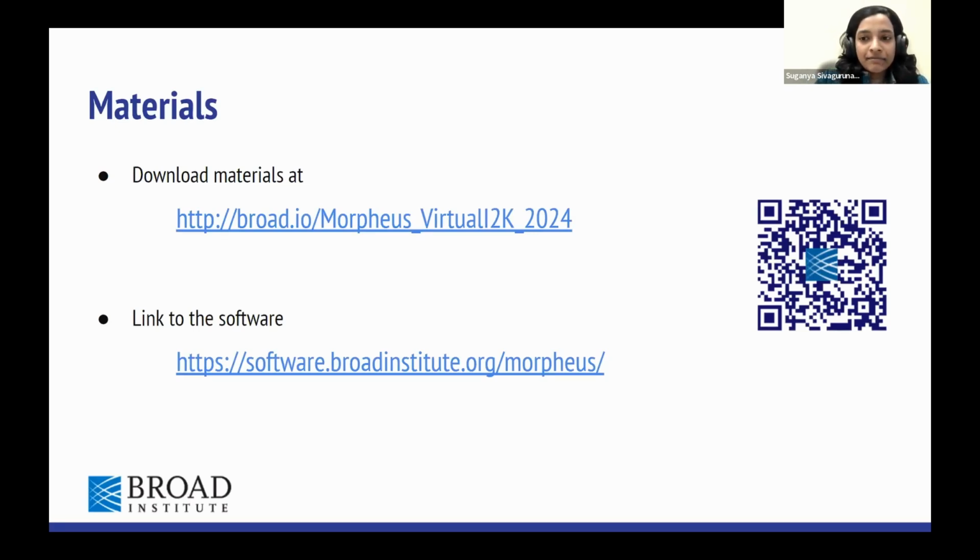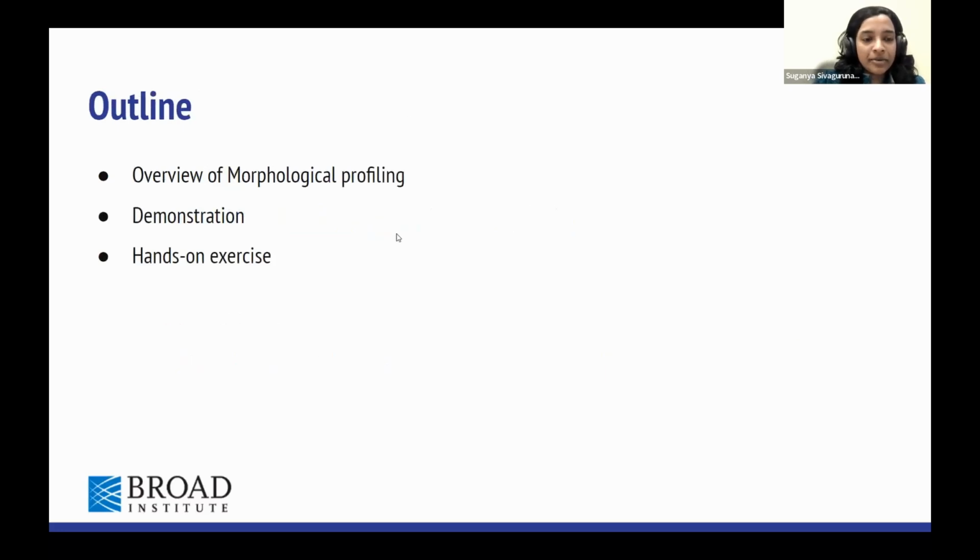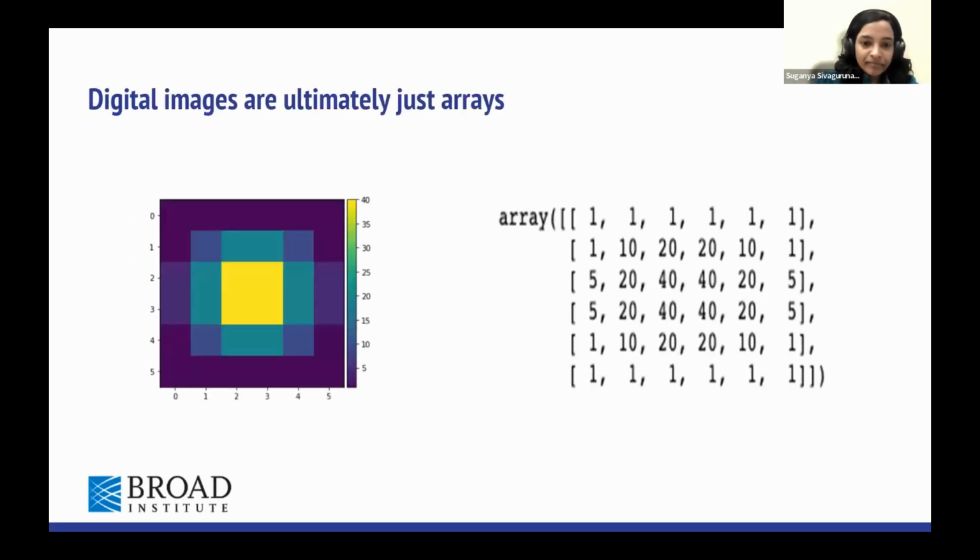Yeah, so I have structured the workshop in such a way where I'll be giving you an overview of morphological profiling. Why I'll be talking about morphological profiling is I'll be showing the use of the Morpheus tool, explaining morphological profiling. And then I'll give a demonstration of Morpheus using the various features, how you can explore your microscope information that you obtained from microscope images. And then the third part would be the hands-on exercise. First, I'll jump into the overview of morphological profiling.